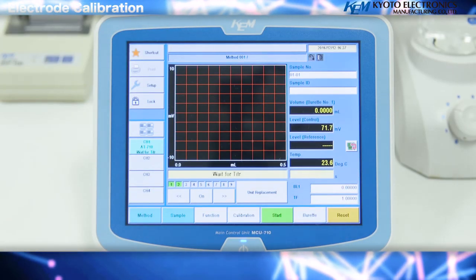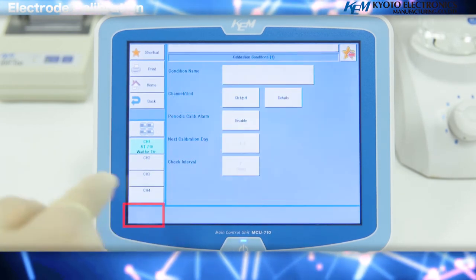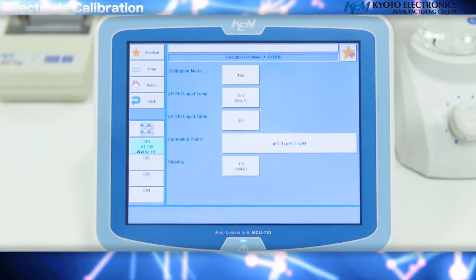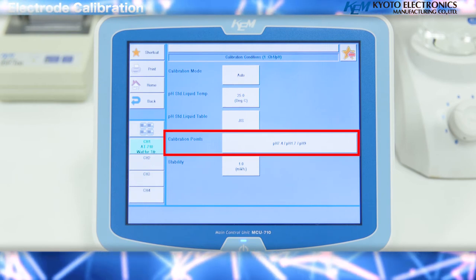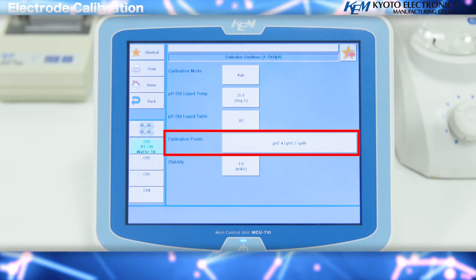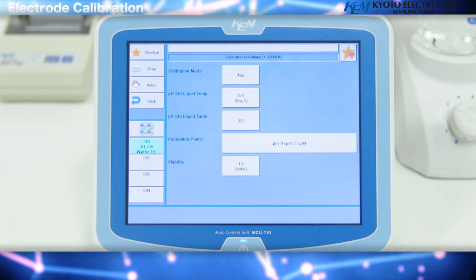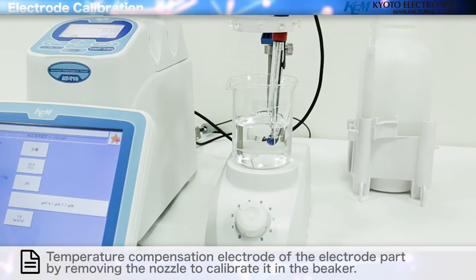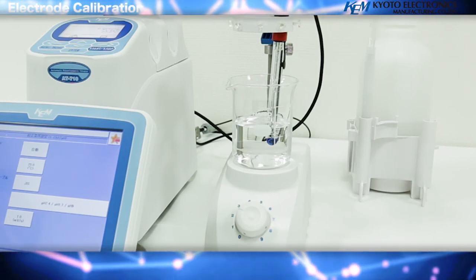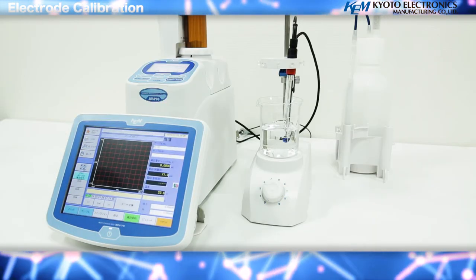Electrode calibration: press the calibration key, then press edit. Press the details key of the calibration condition settings channel and check the calibration point. The values should be set to pH 4, pH 7, and pH 9 — you may set these values at will. Please leave the electrode and the temperature compensation electrode in the electrode holder and remove the nozzle to calibrate the electrode. When done, press the home key to return to the home screen.